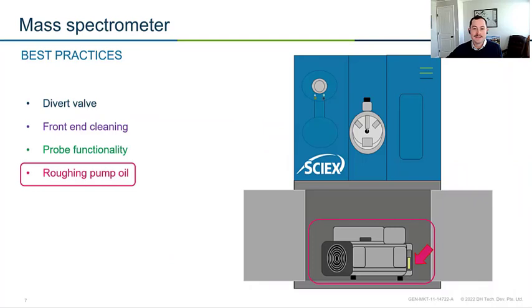This is something that I ended in based on a personal story of mine, where I joined a lab and there was an old GCMS single quad in the corner. I don't think anyone had used that instrument in maybe 5 or 6 years since I got there, and I certainly hadn't touched it. Some time went by, none of us had really paid attention to it. It seemed to be fine. And then we noticed there was quite a big oil spill underneath that mass spec.